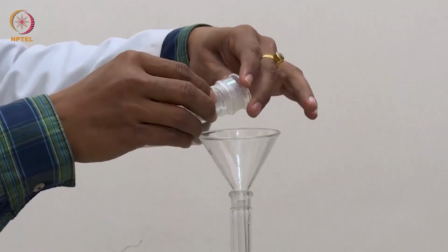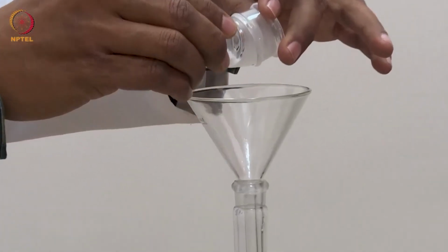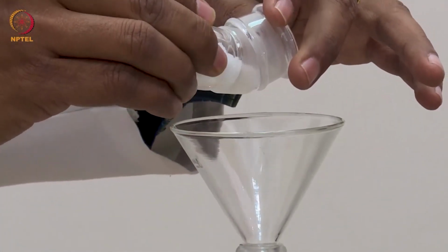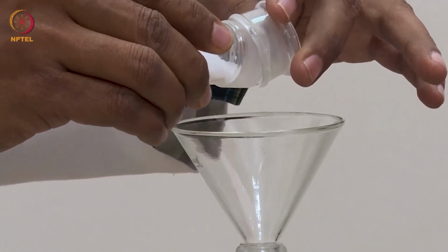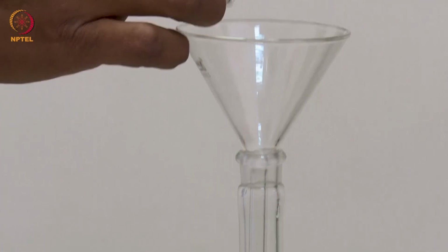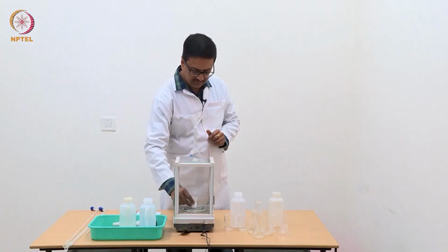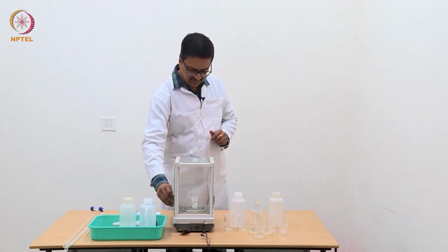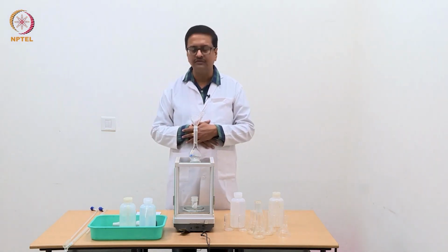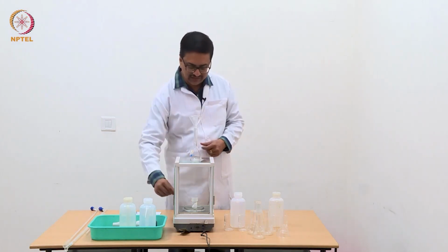So I am now taking out this bottle from here and carefully trying to transfer a very small amount, by not moving the lid completely away, but carefully transferring tiny amounts of oxalic acid into the volumetric flask and then taking it down, and will place it back on the balance. And what I see here is it is reading 34.22. That means we have not transferred enough oxalic acid.